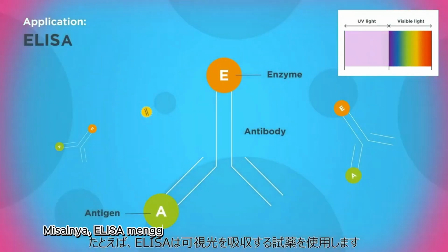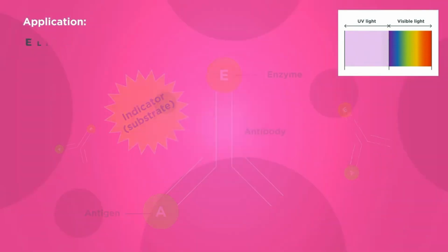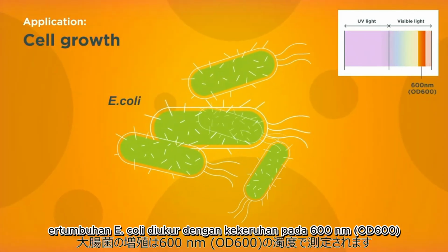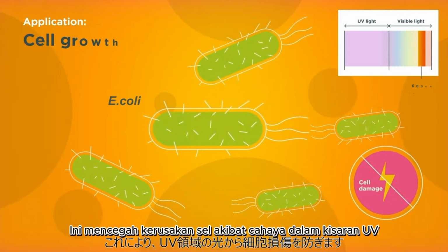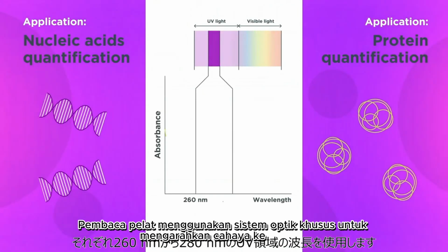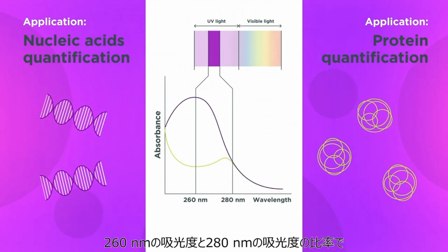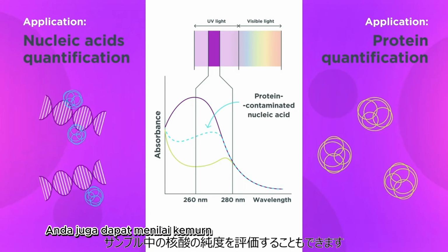For example, ELISAs use indicators that absorb light in the visible wavelength range. Cell growth is measured at 600 nanometers, OD 600, which prevents cell damage from UV light. Whereas for nucleic acids and protein quantification, you use UV wavelengths, 260 and 280 nanometers respectively. The 260 to 280 ratio can also assess nucleic acid purity in your sample.